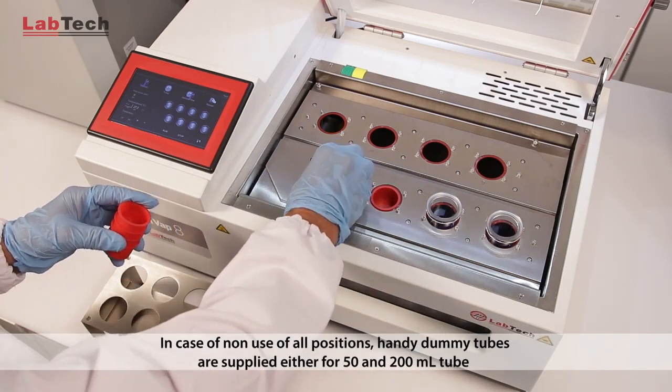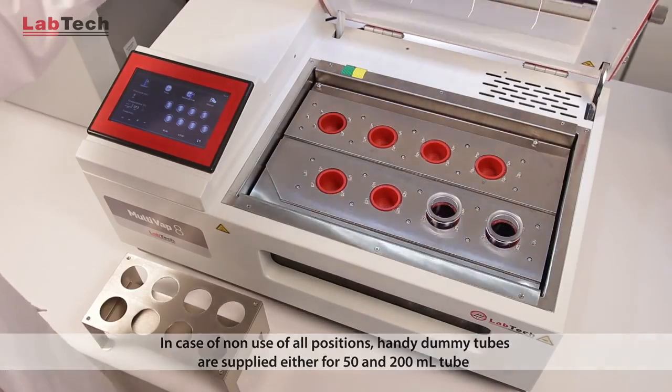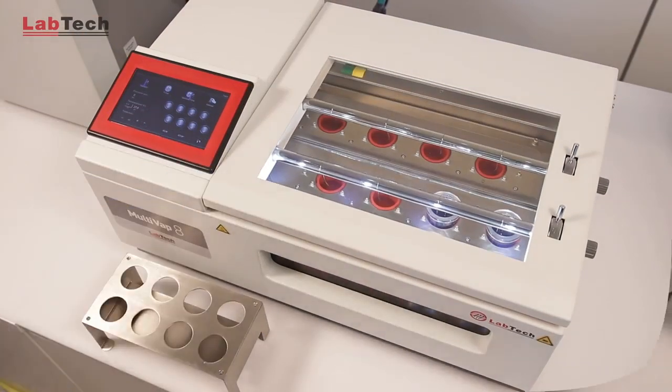In case of non-use of all positions, handy dummy tubes are supplied for both 50 and 200 ml holes.